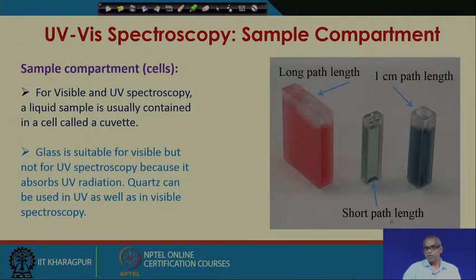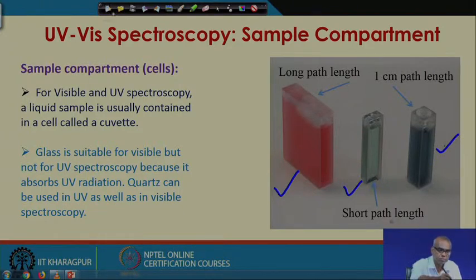You see a few images of cuvettes of various path length. You have a cuvette of long path length, you have a cuvette of short path length, and you have a cuvette of 1 centimeter path length.